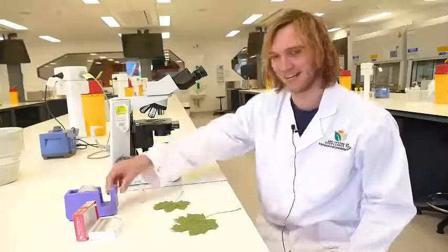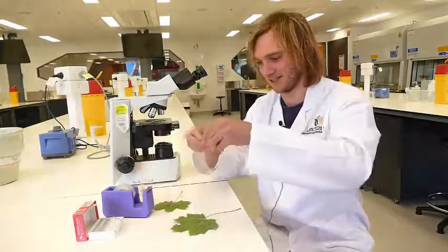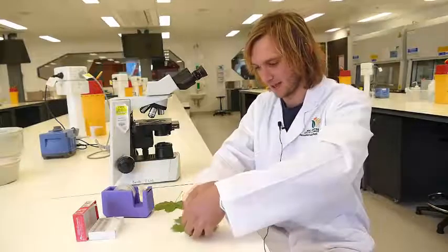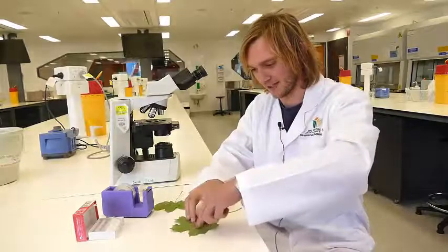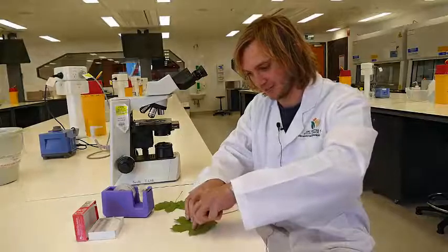Once the nail polish is dry, take a small section of sticky tape and press it down firmly over the leaf where the nail polish has been applied.